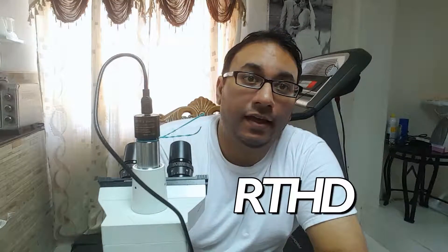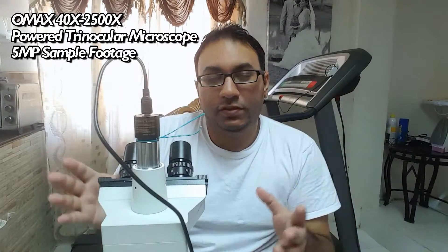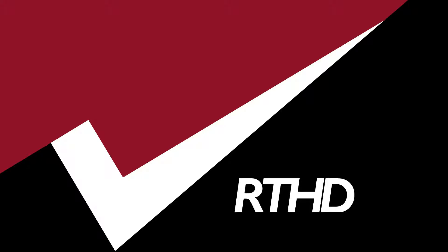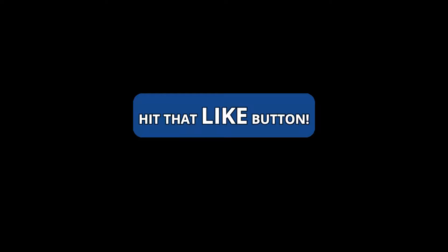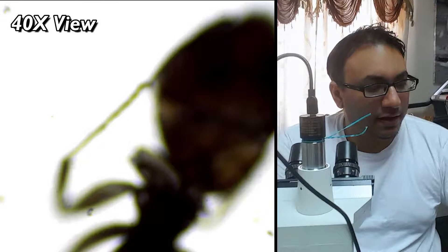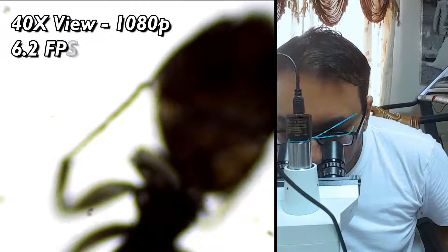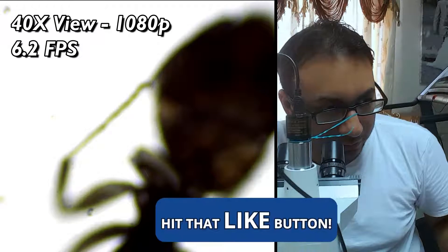Hey guys, welcome back to another episode of RTHD. Right now I'm going to show you guys the OMAX 40 to 2500X microscope. I want to show the actual footage on the camera — I have it already connected to a laptop. Right now I have it set to just the 40X view, and I'm going to do the recording so I can overlay this. It's recording at the moment, and this is at 40X.